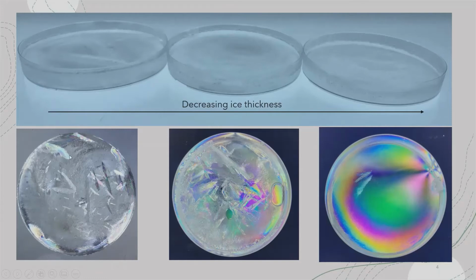And where we see the very minor areas with some colorful display is where we have a little bit of water inclusion or some thinner ice, where we still have some of the pleochroism being displayed. However, as we decrease the ice thickness, we see smaller blades of thinner ice that display even more pleochroism. And as we get to the very thin ice, we can see a very gorgeous mosaic of colors passing through the polarizing filters.